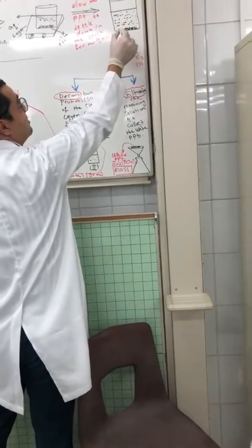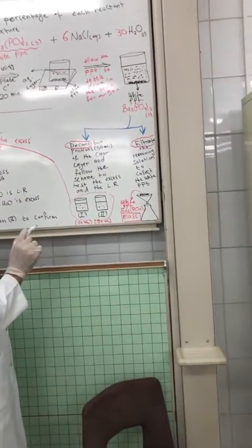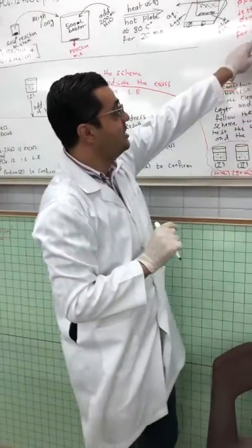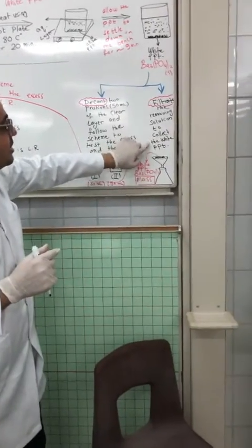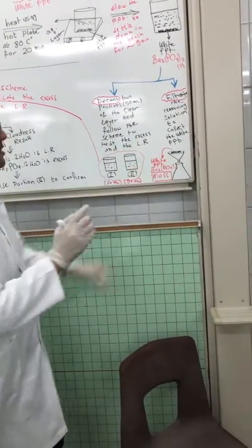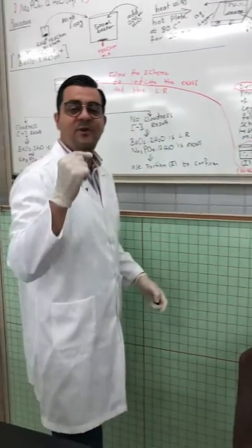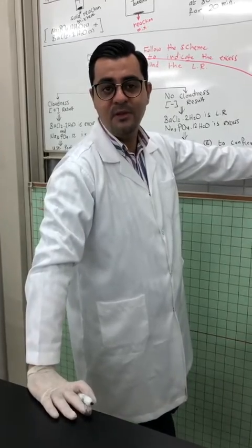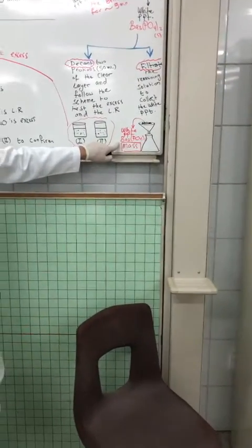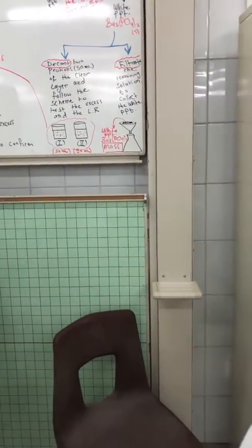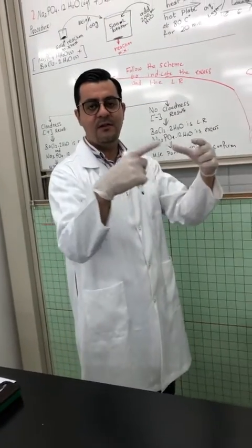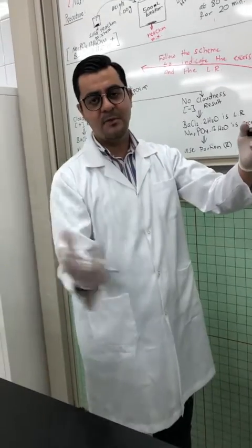The second step is filtration. After decanting two portions, the precipitate and some water are still in the original beaker. We will filtrate the remaining mixture to collect the white precipitate of the product. The mass of the white precipitate is fundamental to carry out our procedure. To record it correctly, weigh the empty filter paper, carry out the filtration, wait until the filter paper is dry, then re-weigh it with the precipitate and subtract the mass of the empty filter paper to get the mass of the precipitate accurately.